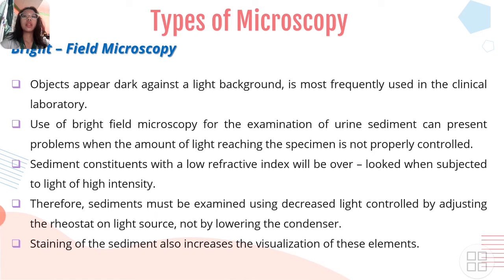Sediment constituents with a low refractive index will be overlooked when subjected to light of high intensity. Therefore, sediment must be examined using decreased light, controlled by adjusting the rheostat of the light source, not by lowering the condenser. Staining of the sediment also increases the visualization of these elements.